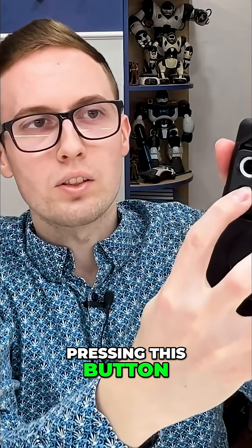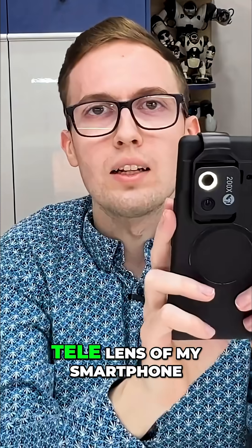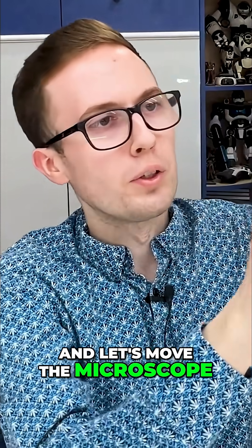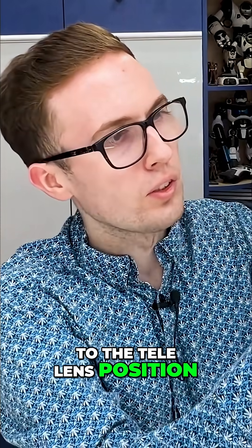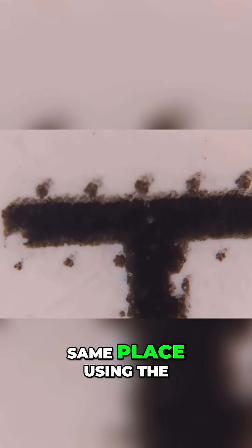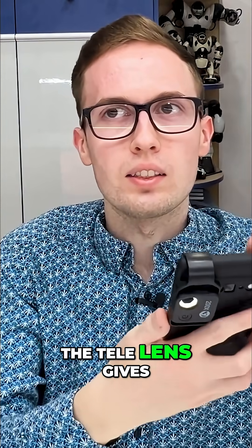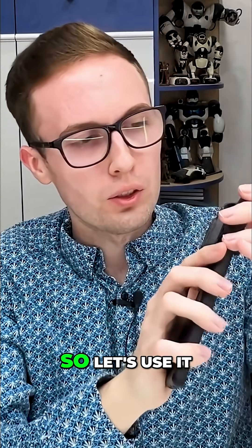Let's turn the light on by pressing this button. Now let's switch to the tele lens of my smartphone and move the microscope to the tele lens position. Here is the same place using the tele lens — it is impressive how much we can zoom using just a smartphone. In my smartphone, the tele lens gives the best result, so let's use it.